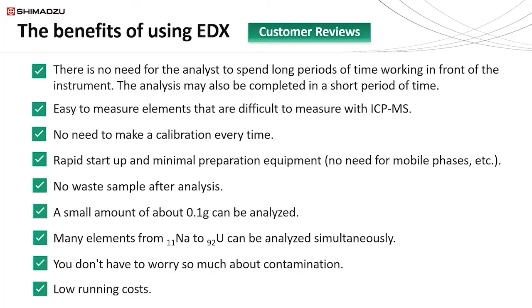And this can be very important in, for example, a research and development or a research and discovery type environment where basically very small amounts of material are being synthesized. So having a non-destructive technique for elemental analysis is a big plus when it comes to these environments. A small amount can be analyzed, as little as 0.1 grams.